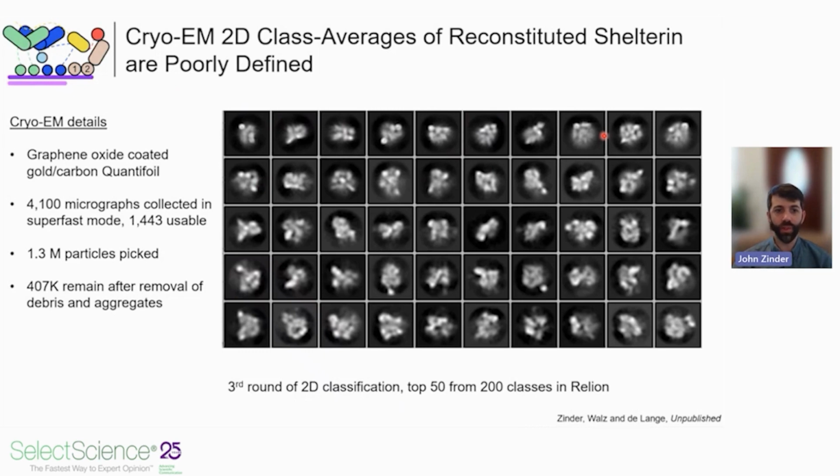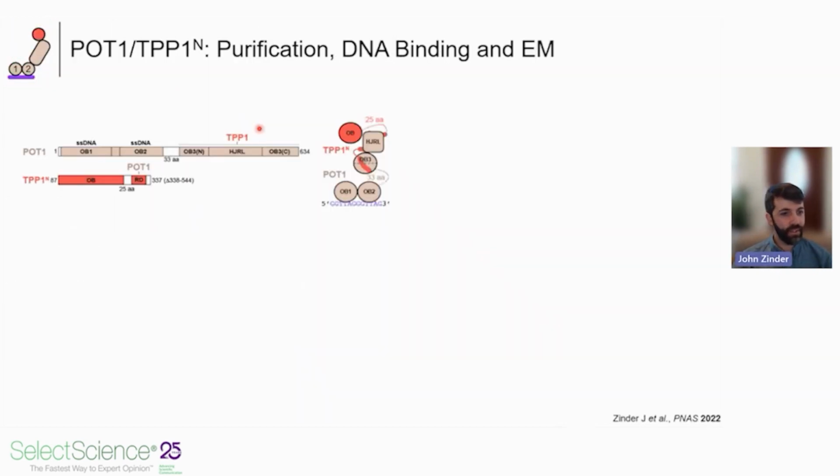And we really wanted to get a handle on what this thing was doing in terms of its conformational flexibility, because this is a negative result, and we wanted to have some way to actually physically observe this flexibility rather than just say, because the Cryo-EM didn't result in high resolution structures, it's too flexible. Okay. So for this, we turned to negative stain EM, and I can talk a little bit in the Q&A session if you are curious about why negative stain EM is especially good for flexible complexes, but suffice it to say, this was our reasoning for turning to negative stain EM.